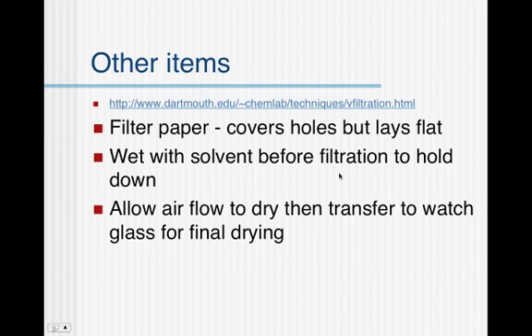Some more filtration techniques are on the website that is shown on this particular slide, but there are a couple other items to make sure of. This is actually an easy process once you get some practice. You need to make sure that the filter paper you use on the Buchner funnel is the right size. You want to cover all of the holes in the Buchner funnel, but you don't want it to fold up along the sides. That creates gaps, and your solid will infiltrate around the filter paper and wind up with some of your product in the liquid.